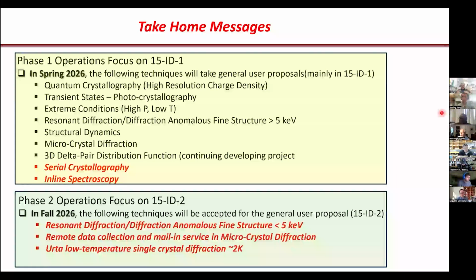Then we cut down the horizontal size. We used the slits to move it down. But now you don't have to. You can focus everything on the one sample position. So you gain a lot of power density, which is the flux at the sample position. But I think the worry is how the radiation damage comes out.